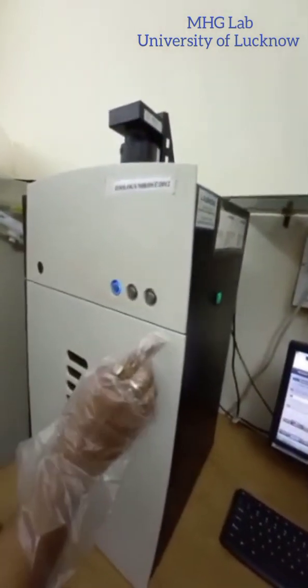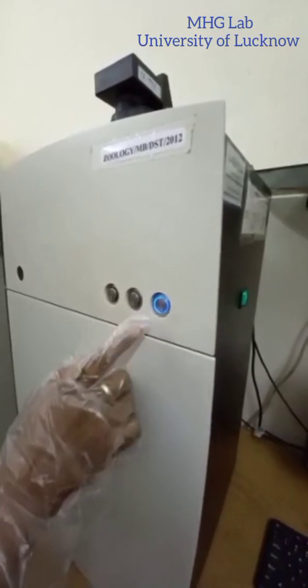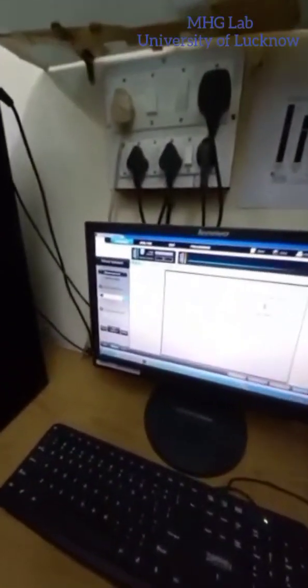Now coming to the machine, we will switch off the white light and we will put on the UV and we will start the exposure. So here we can see the gel.